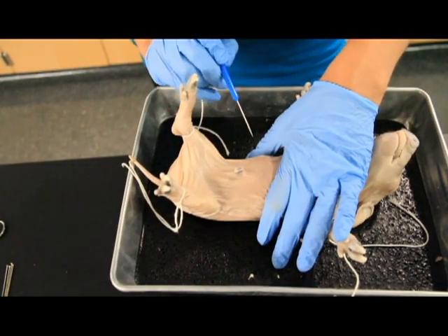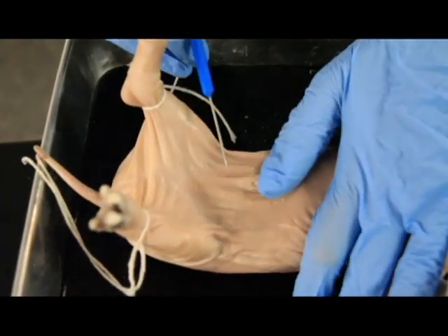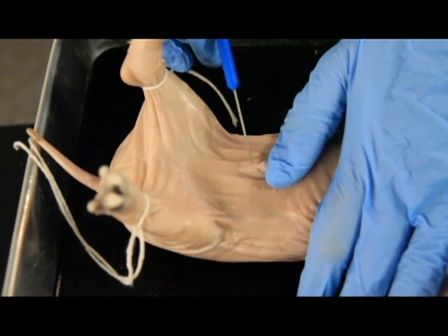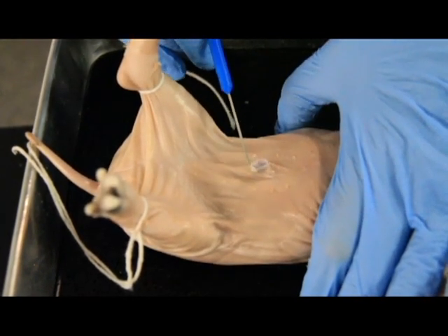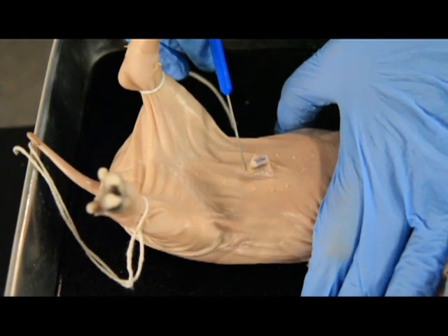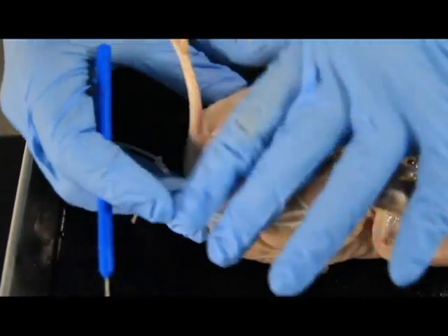As we examine the female, the first thing you can notice is, yes, she does have these mammary papilla right here, but the first thing she does not have is this hole right here, and that hole was the urogenital opening. So if we look right under this umbilical cord and we don't see a hole right here, that means it is a female, and her urogenital opening will therefore be back here.